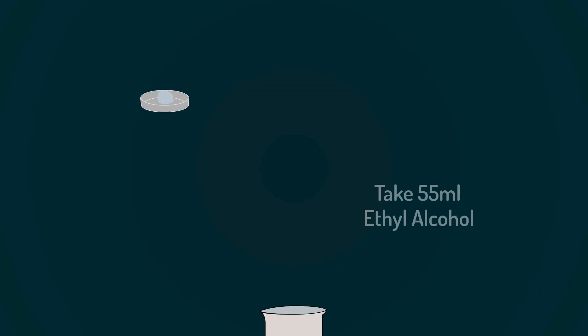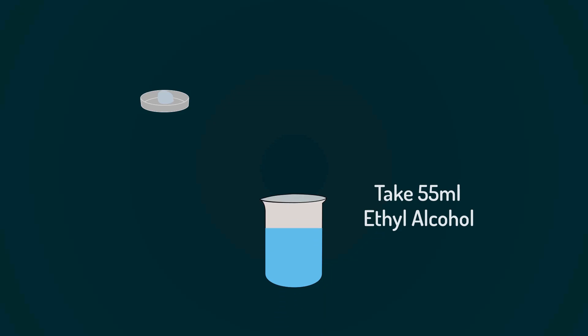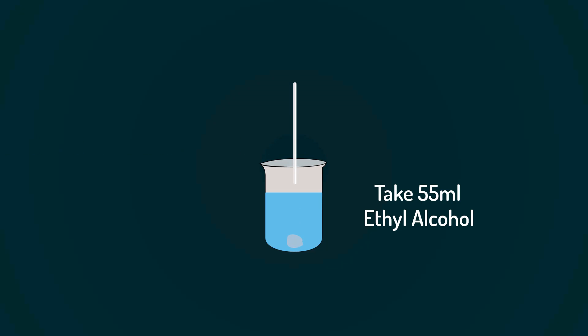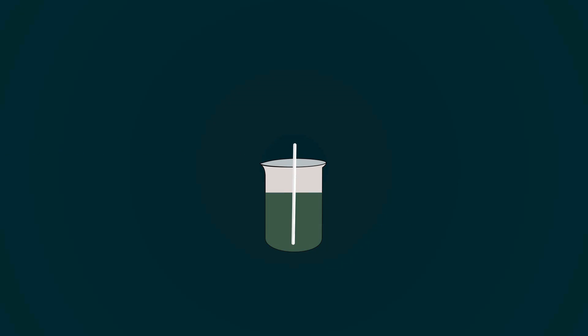Take 55 milliliters of ethyl alcohol into an empty beaker. Add measured powder into the beaker. Mix it with the help of spatula.